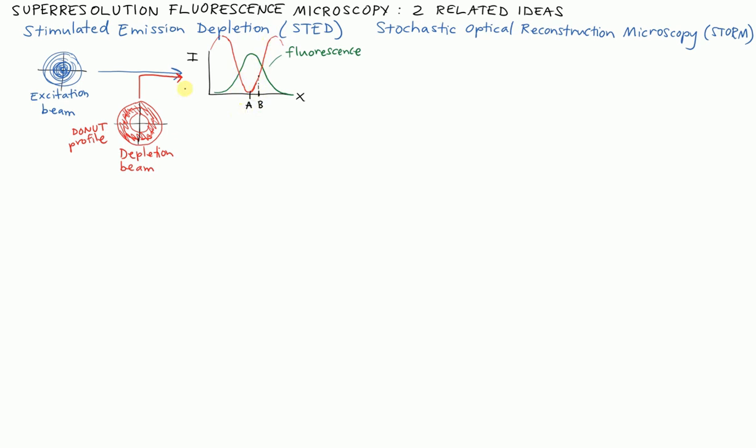We've already talked in the course about the idea of a fluorescence quantum efficiency. We gave that the Greek variable phi, and we could say that the fluorescence quantum efficiency at some location in the plane of illumination is a function of x and y. In general, we've learned that there's a certain decay rate due to fluorescence. We would call that k sub f. And then the denominator is going to be the sum of all the decay rates. So one of the decay rates is k sub f.